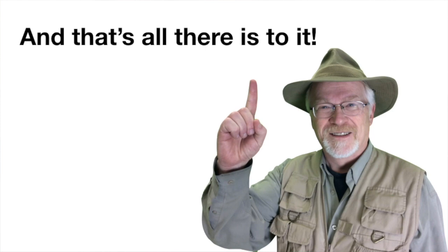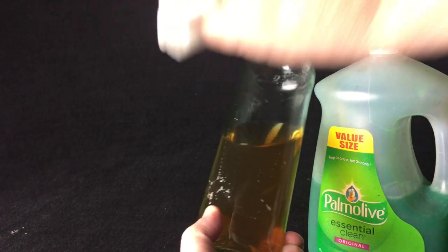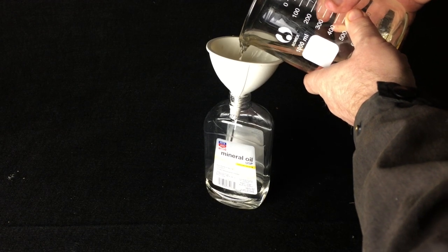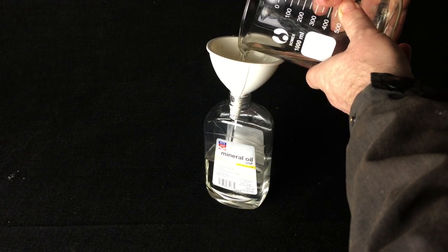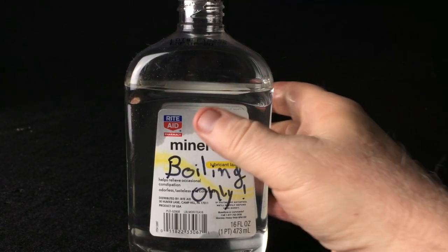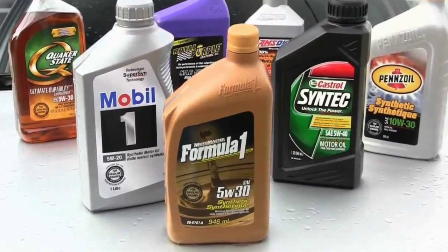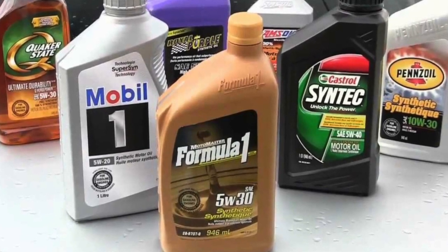And that's really all there is to it. When you're done, just let everything cool down, then clean the outside of the bottle with a little soap and water and return the oil to its original container. While the oil lasts essentially forever, over time it will invariably pick up contaminants from the environment. So just make sure you label the bottle appropriately and only use this oil for heating glassware from now on. By the way, if you don't have access to mineral oil, you can also use synthetic motor oil.